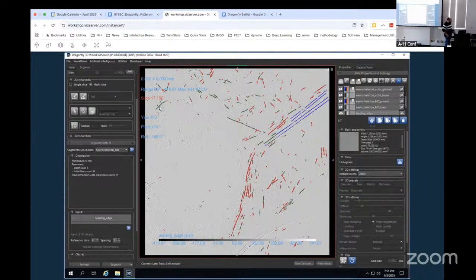But if you were going to train a network to try to find these objects, I would suggest doing this first: segmenting your data set, cropping out whatever you want, fixing the little imperfections that it has, and then retraining your network.